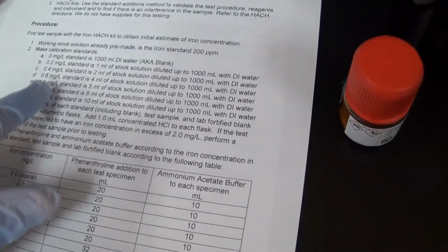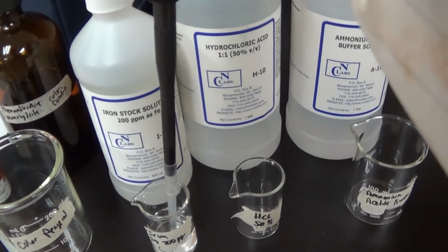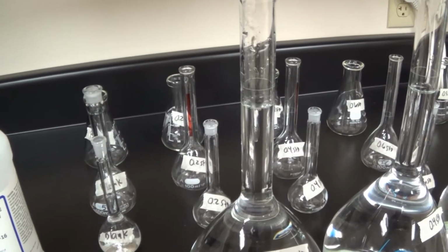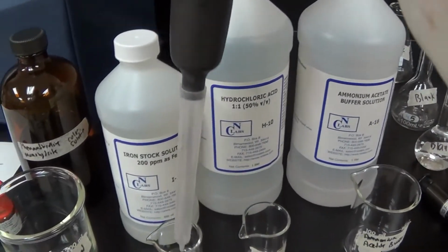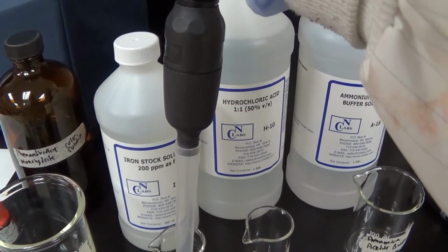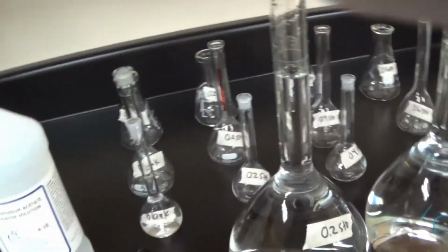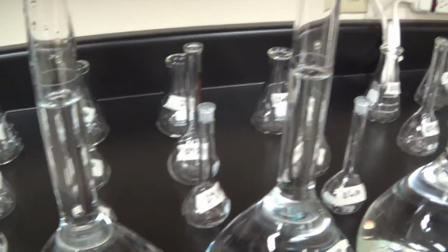So now I have poured out some of my iron stock solution into a different beaker, and then I'm going to follow the directions here for each standard. This one here, add 1 mil, 2 mil, 4 mil, 5 mil. So that's what I'm going to do now. Add 1 mil. The next one gets 2 mils. And then I'll keep going on and fill all these to 1000.